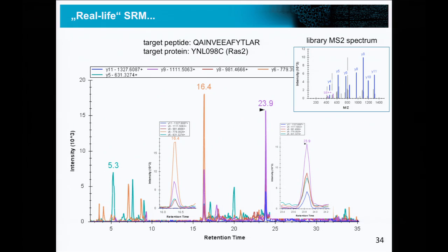And actually Skyline has a very fast way of conveying this information to you, how well the spectrum matches the different traces. This is called the dot product. Skyline will report for you, and you will see this a lot in the next days, a dot product for every peptide. What this dot product means is it will just make a correlation between the intensities here in the spectrum and the intensities measured here in these 2 SRM traces.